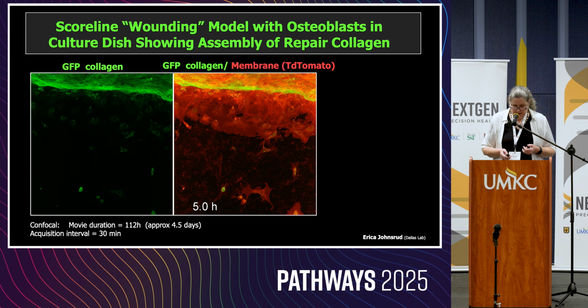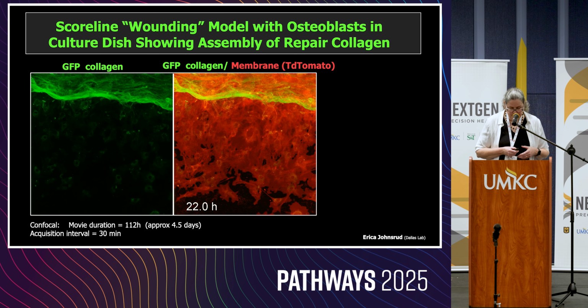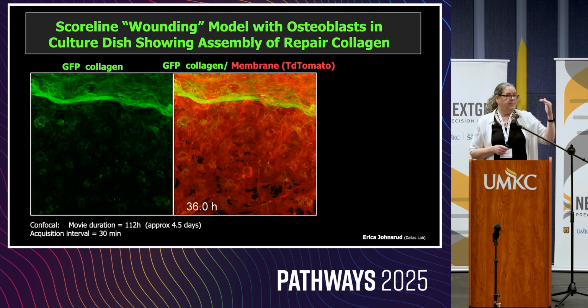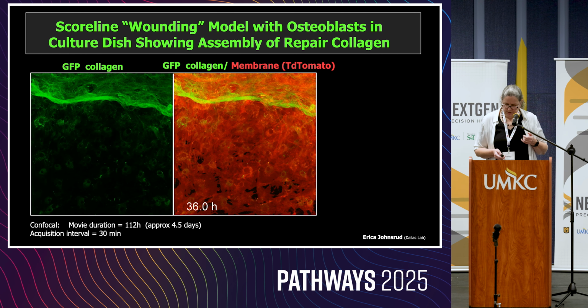Now, this next movie, I'm going to ask you to stop this when the cells on the right reach the bottom. So at this point, you can see the cells have migrated in. We're looking at one edge of the wound. They've completely filled that wounded area. They're confluent, but we haven't really seen much collagen assembly yet.